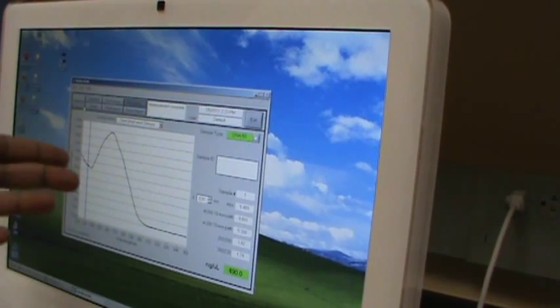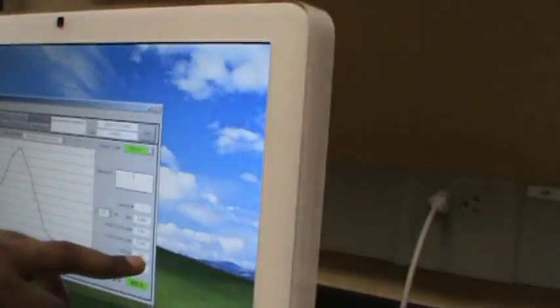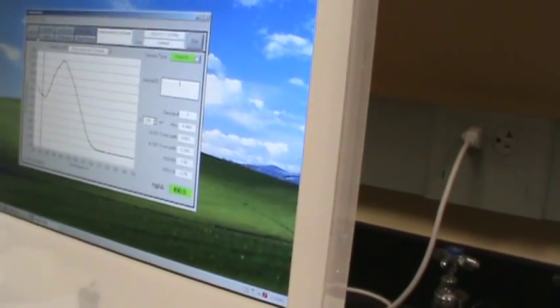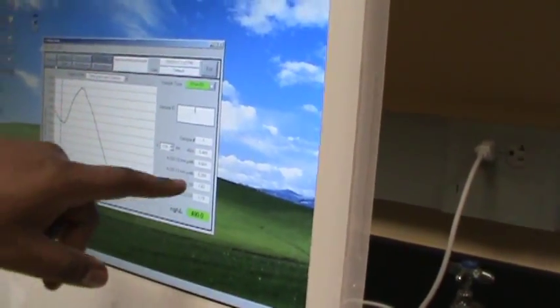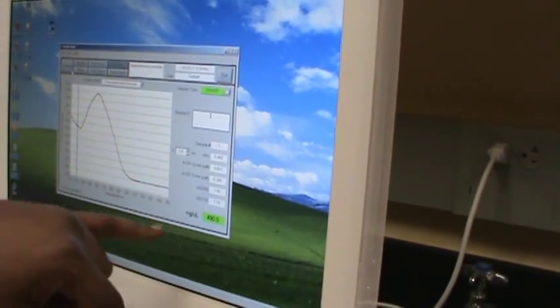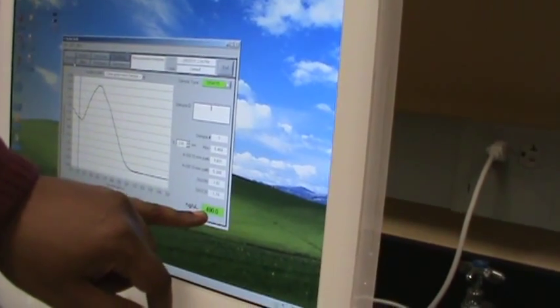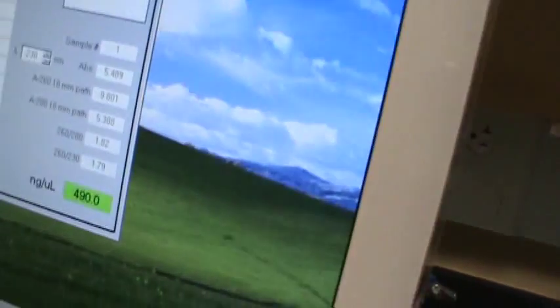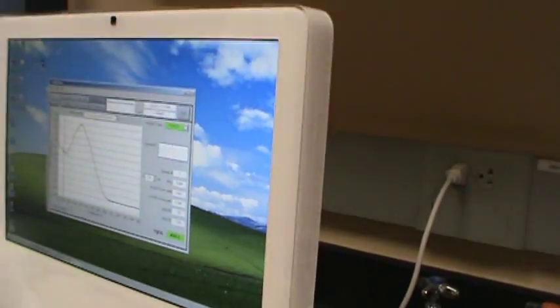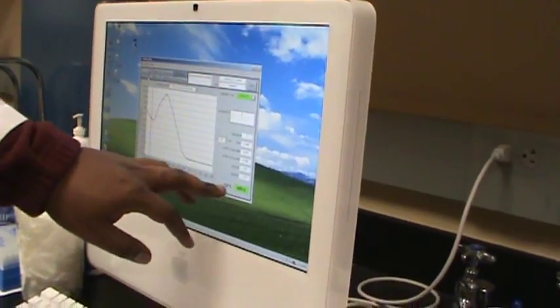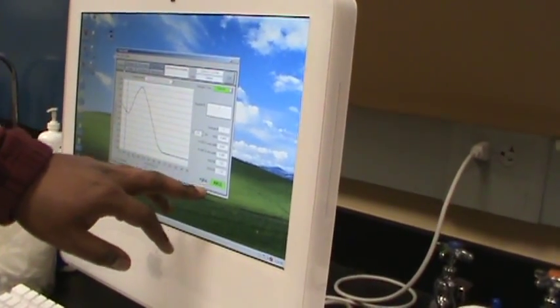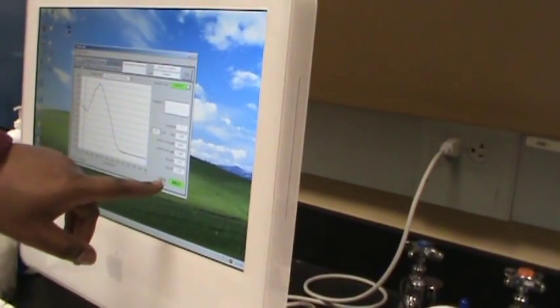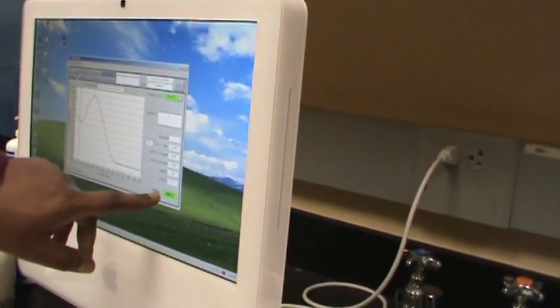So you can safely assume the sample is mostly DNA. You look at your ratio here, 260/280 is 1.82. So this shows the purity right here. Your concentration is about almost half a microgram per microliter. So 490 nanograms per microliter is the same thing as 490 micrograms per milliliter. So multiply both sides by 1,000.